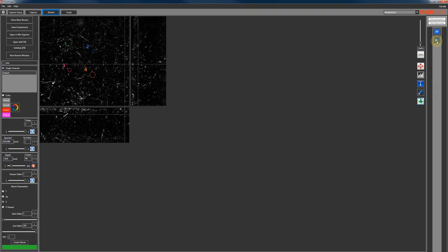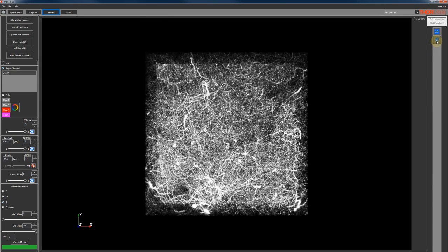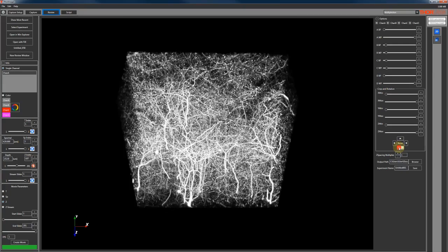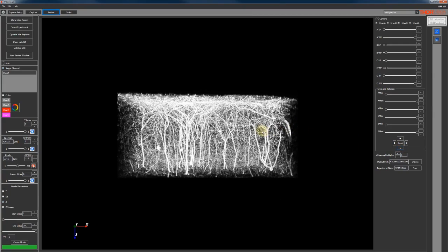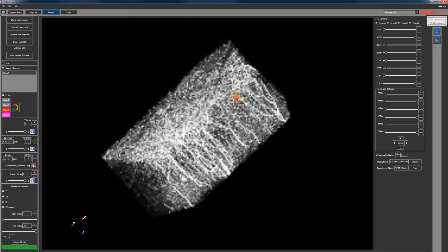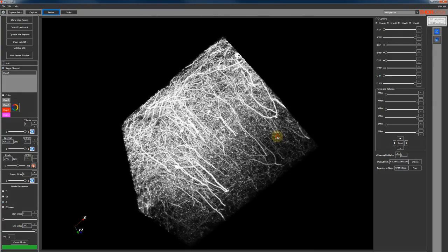The image stack can also be viewed in 3D. The axial view is adjusted by opening the options and using the directional buttons. We can also use the mouse to click and drag the view of the stack. Once we let go, it revisualizes the stack.